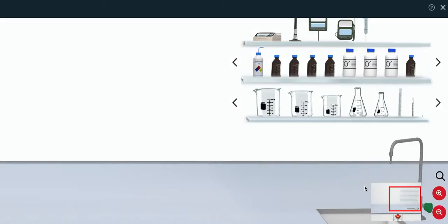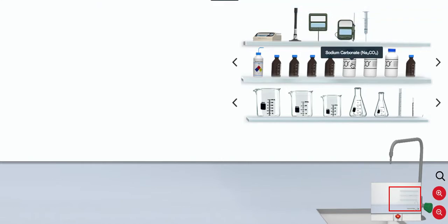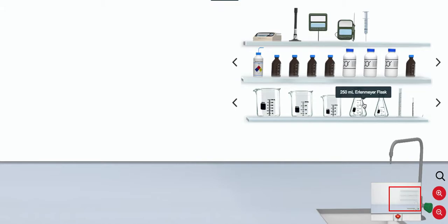Once inside the lab, you'll notice that the instruments, materials, and container shelves have been separated, so it's easier for students to view what they'll be working with in the lab.